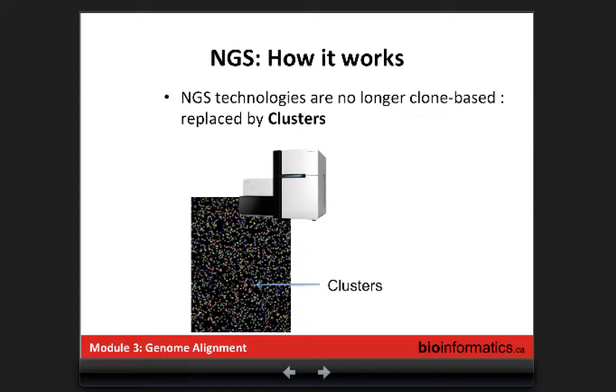So the next generation sequencing, how does it work? It works on the same idea of using fluorescent colors for each base to be able to retrieve the sequence. But the idea is to do millions of sequences at a time. This is a small part of an image of a flow cell. In the flow cell, each cycle it will take a picture of this gigantic image of dots and try to determine, for each cluster, which color it is for each cycle.